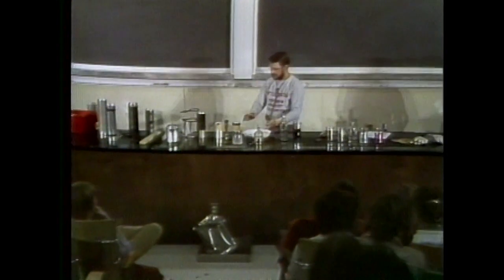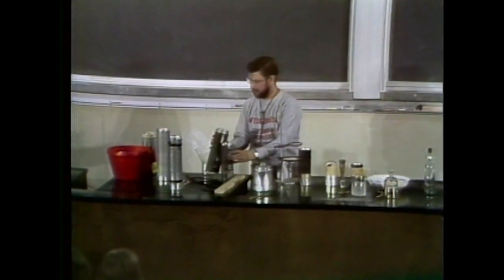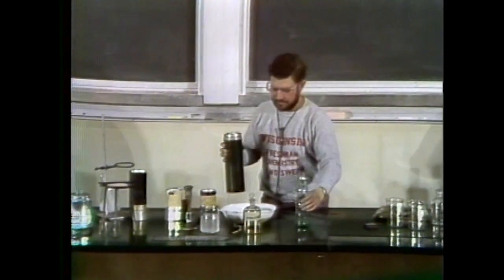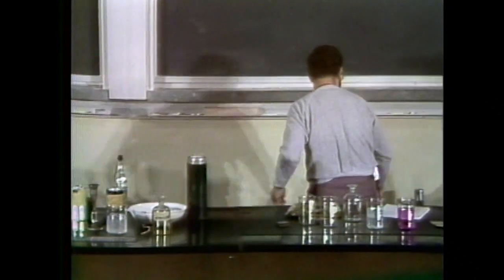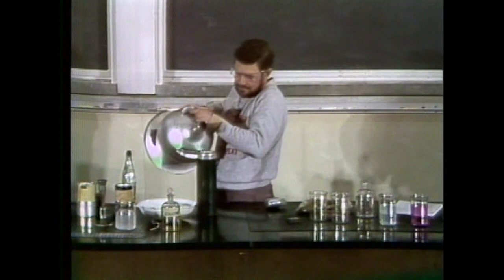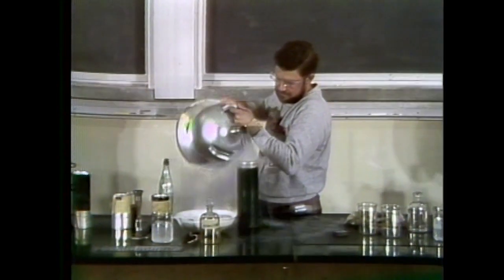I'll tell you what, Bucky, I've been doing some demonstrations with liquid nitrogen here, and let me do one for you here. Maybe this will make up for all the things that have happened so far. Of course, I need a little more liquid nitrogen here, so I've got it. When you're around, Bucky, we go big, big style.